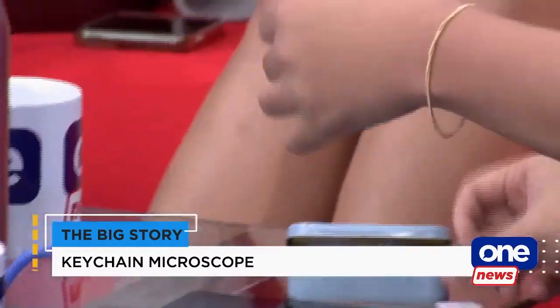So here's the microscope. It's like the size of a keychain, very small. I'm just going to place it on top of my front camera on the tablet. Just like that.